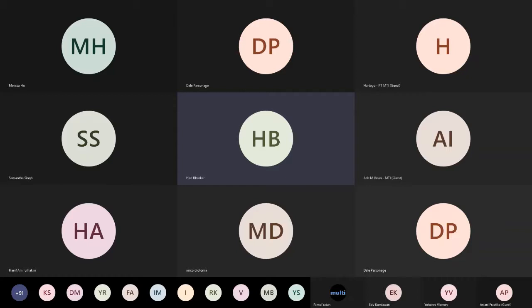Now you can decide on the frequency of running your monitor. Many customers run the monitor every day in the morning. Some customers, I see, run it once in a week. If the machine is running round the clock without switching off, then the monitor can be run say once in 2 or 3 days or once in a week, things like that. But a good lab practice would be to run it once every day.